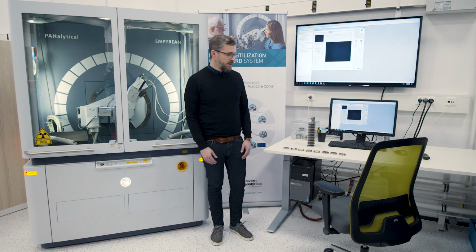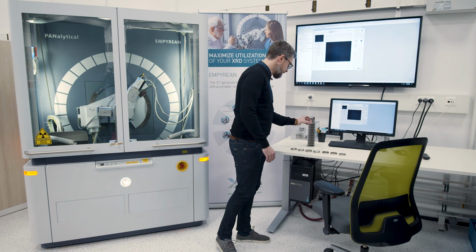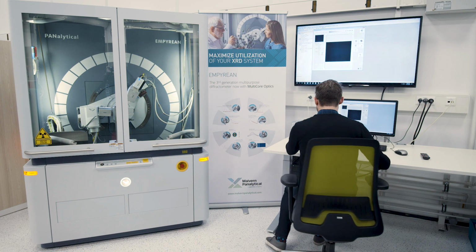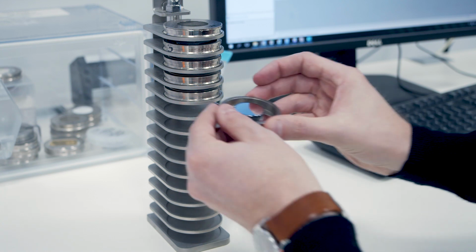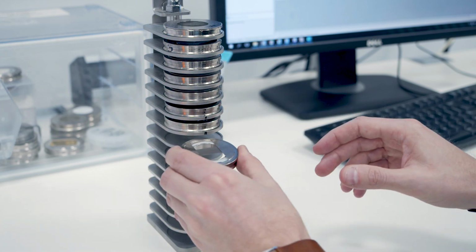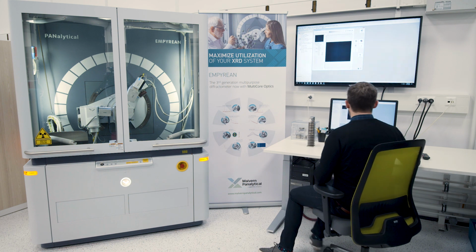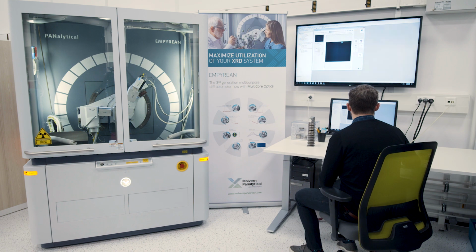So this already brings me to loading the samples in our sample changer magazine. For these measurements, I have already predefined a sequence using our batch function in the data collector. I will just quickly show you what this measurement sequence consists of. So I'm going to open this batch measurement program now.